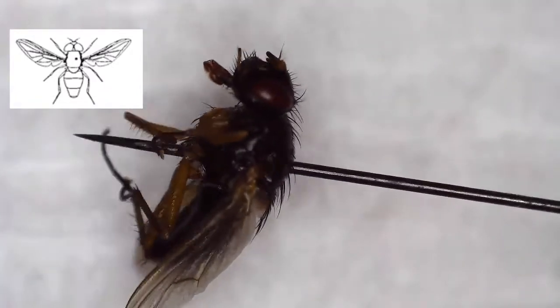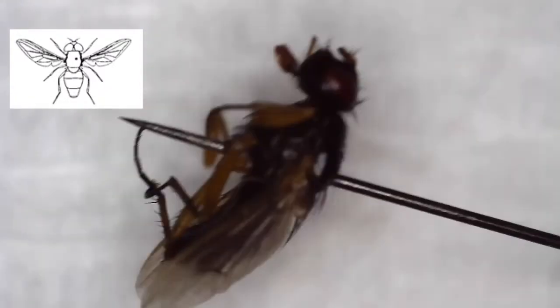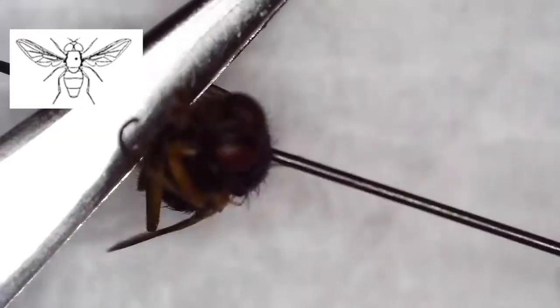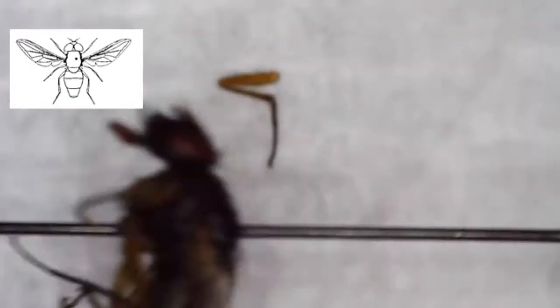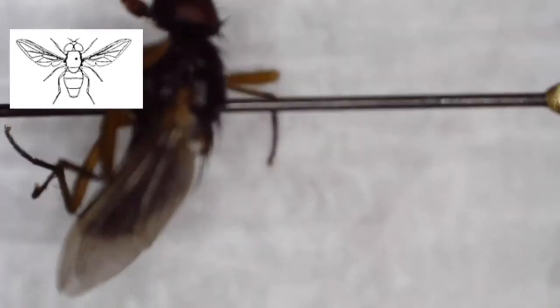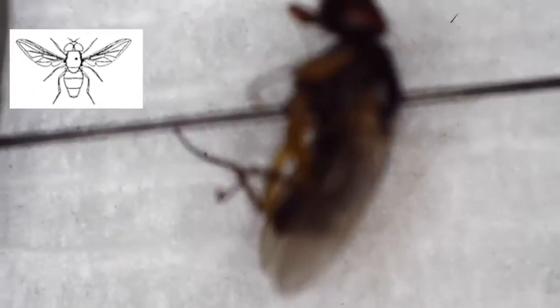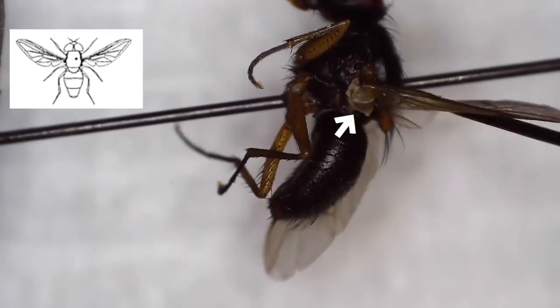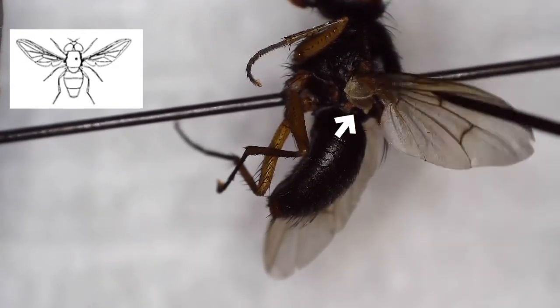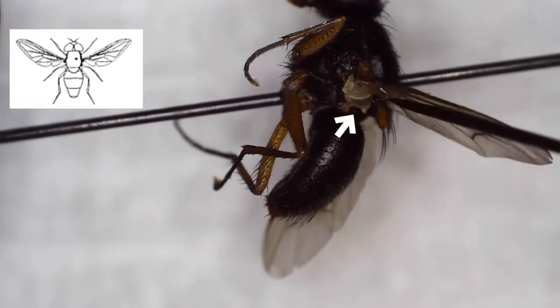This is going to be one of the first things, whoops, I lost a leg there. This is going to be one of the first things that you see when you're trying to key out your adult insects to order. I've pinned my insect slightly right of center in the thorax. It looks like I got the pin nicely perpendicular on that first shot. And what I'm moving out of the way here is that one wing that you see on the left side.